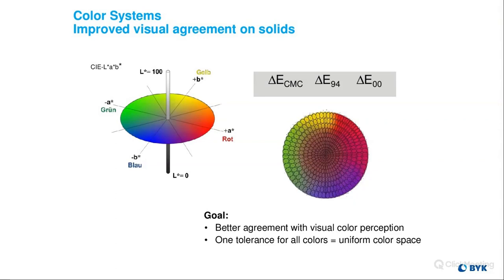All the reflectance bounces off of that white sphere and eventually gets put into the sensor. So those values can change. If you're ever measuring with any of those instruments, make sure that if you compare results with another lab, they're also using the same type of geometry, because if not, you're going to get different values. Based on the industry you're in, they've standardized on specific geometries as well, or maybe not standardized, but preferred. Is that right? Right. Cool. That answer your question, Larry?